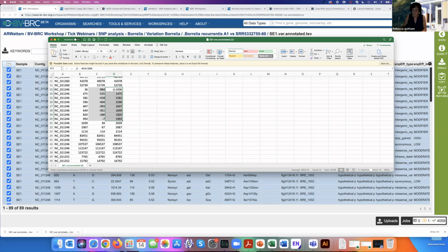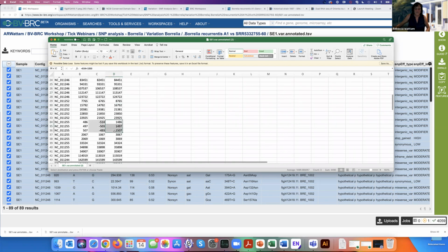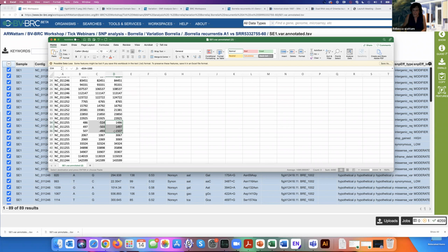The viewer that we use to view these things, if you give it a single nucleotide, it'll be too small. I can't remember how big this genome is, but it's like looking at an individual house in the United States. It would have to be a lot bigger for you to actually see it. So you make the centroid or whatever to show it. That's not actually reflective of the size, but it's giving you a sense of where it is. Does that make sense?